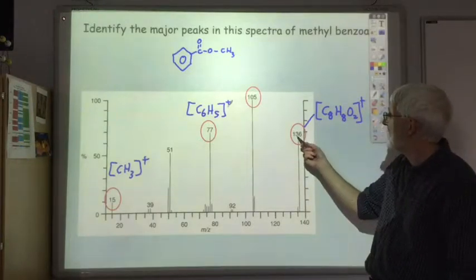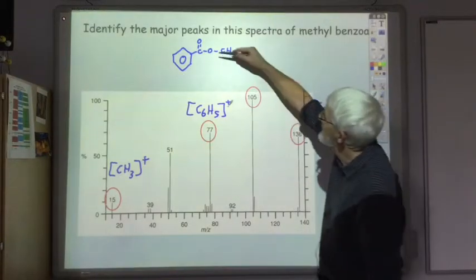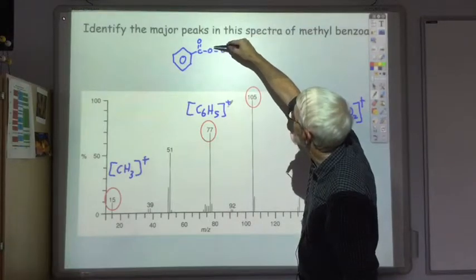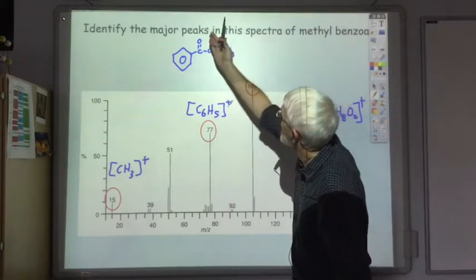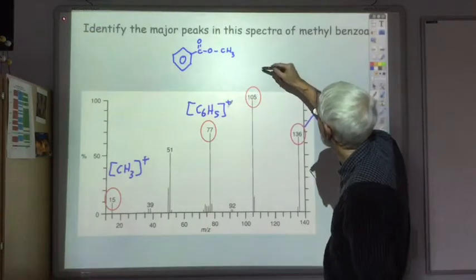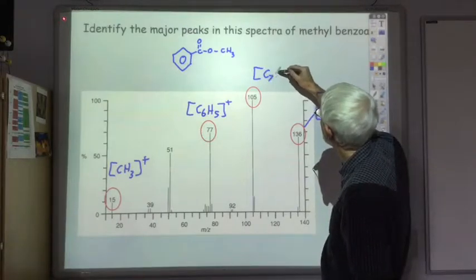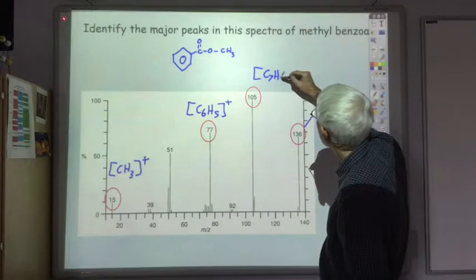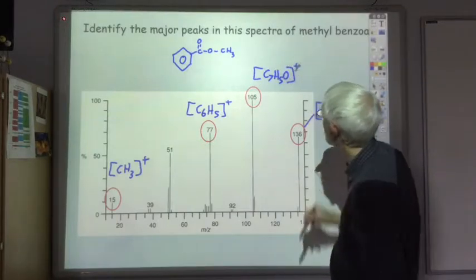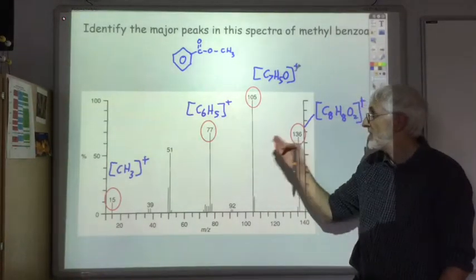so that is 31 less than the parent ion, and we could get that by splitting the molecule here, losing the 16, 28, 31. So that bit to the left would be responsible for the peak at 105. So that would be C7H5O+. Okay. So a careful analysis of the spectra can allow you to identify lots of the peaks.